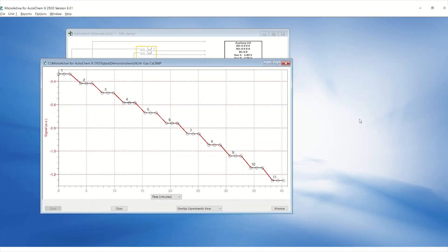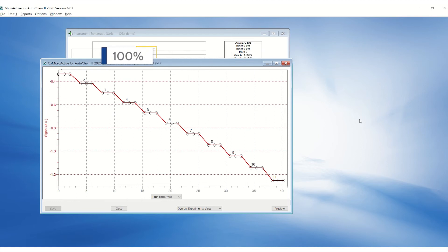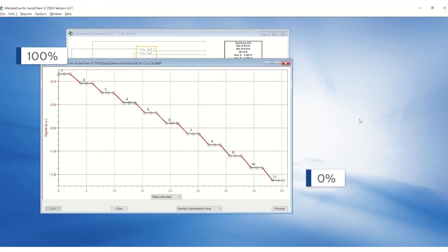Once completed, the data should appear as a set of 11 steps. During the gas calibration, the analyzer decreases the proportion of the analysis gas in 10% increments, beginning with 100% and ending with 0%.